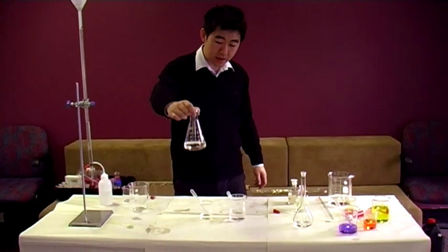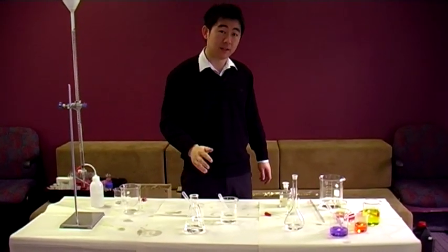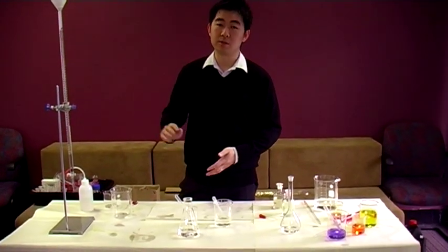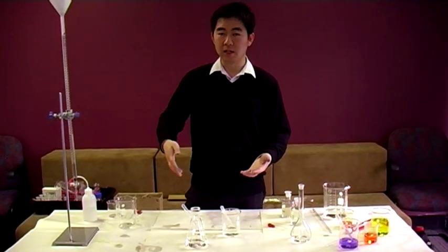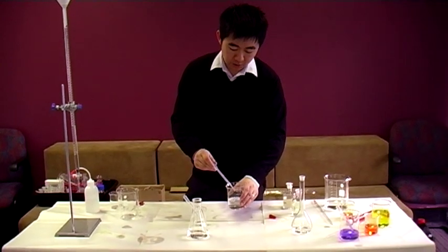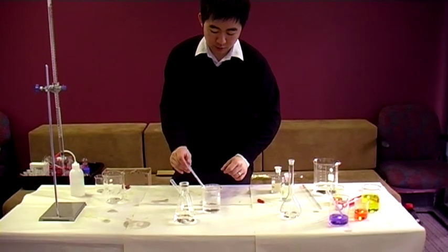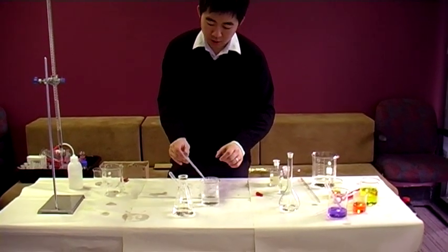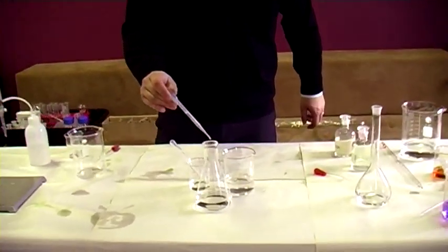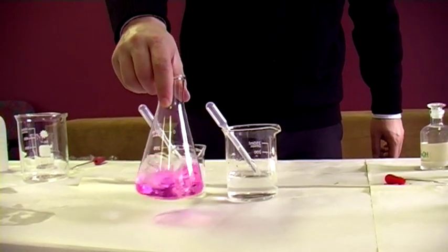Here we have phenolphthalein, very close to the equivalence point. It's slightly acidic because, as you can see, it's clear. Phenolphthalein, as you know, when pH is below 8 it'll be clear, and when pH is above 10 it'll turn a deep fuchsia. In the big beaker we have a base — sodium hydroxide — and in the small beaker we have hydrochloric acid. They're about equal concentrations, but at a single drop it turns pink.